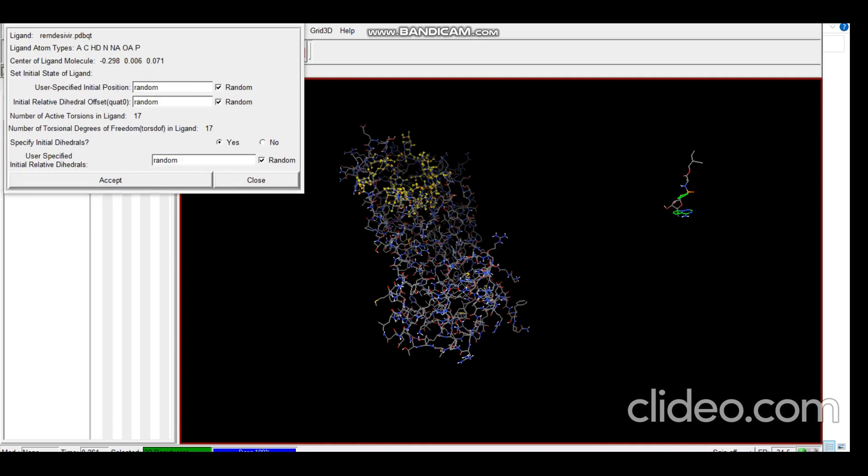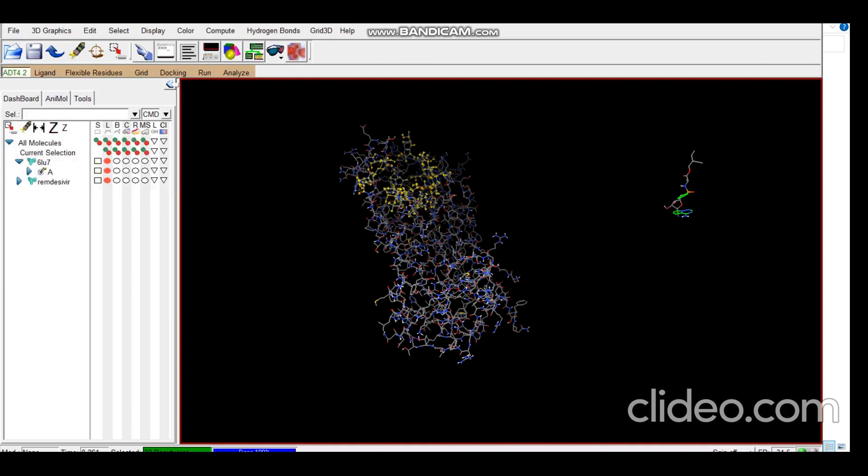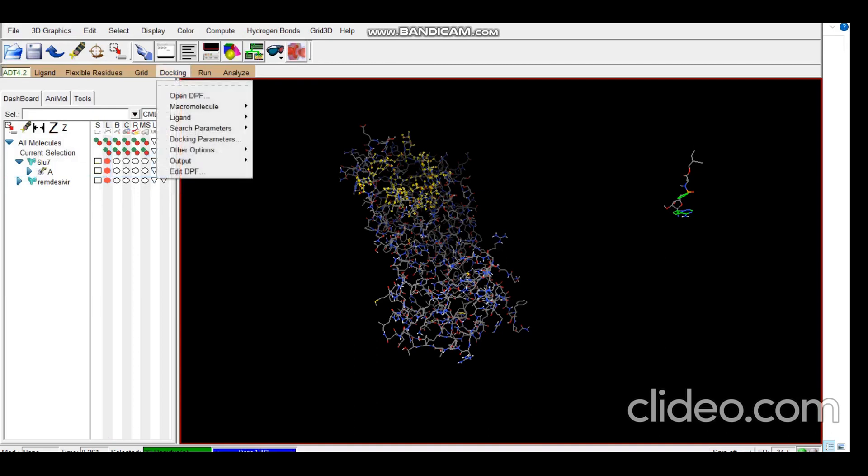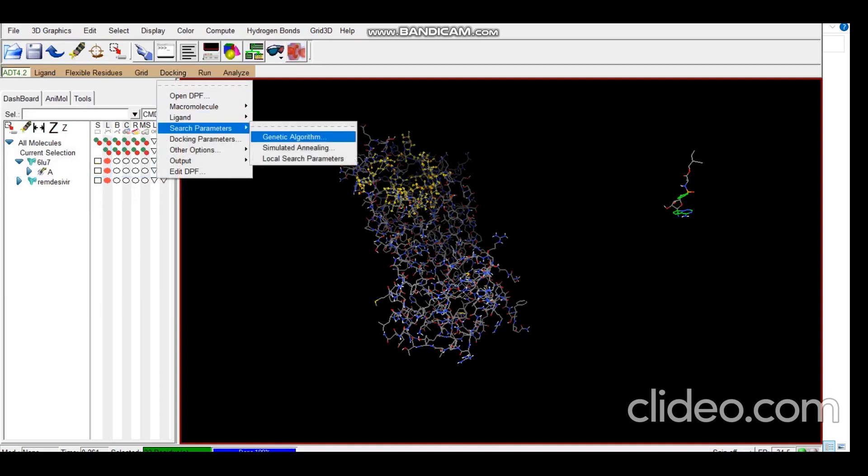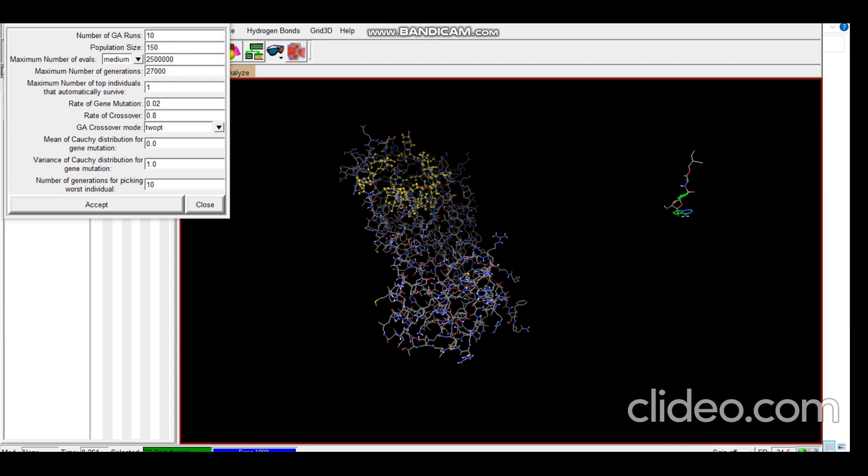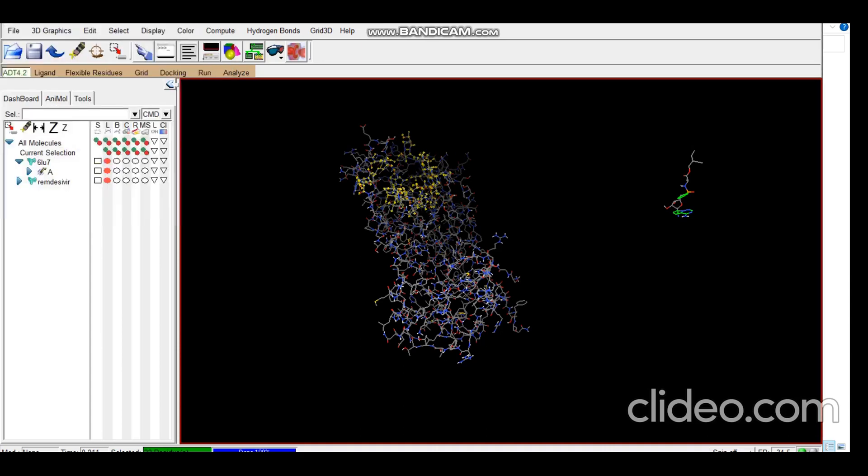So now as you can see there's a pattern for AutoGrid and AutoDock which is similar. Then for search parameters we select Genetic Algorithm as it is probably one of the best algorithms. You can see you can change parameters. You can change the number of runs, it's 10 by default. You can make it 15, you can make it 20 as per the requirement for your research. I'll be keeping it as default.